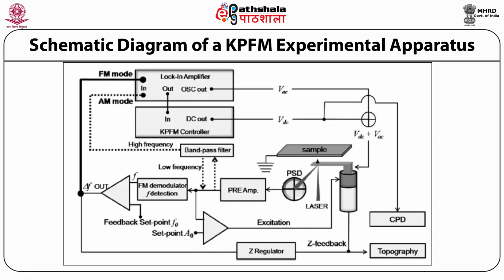For high resolution KPFM, understanding the fundamental difference between the CPD and LCPD is critical, as is knowing how the CPD and LCPD correspond to physical properties of the surface. Application of KPFM to electrical property analysis of nanostructures is reviewed in the second part.